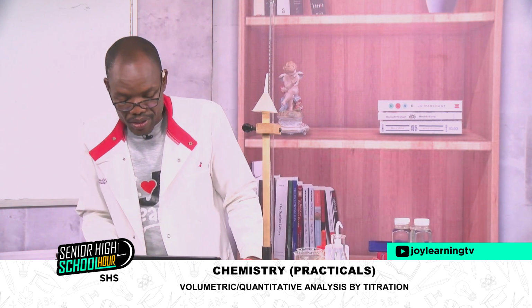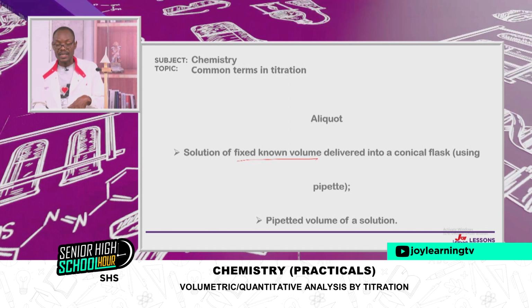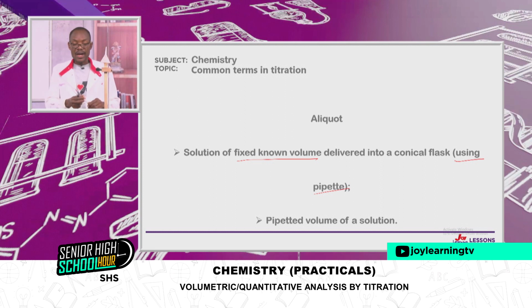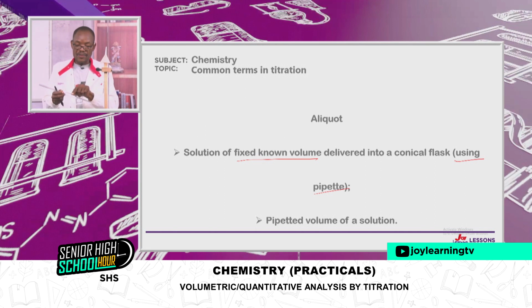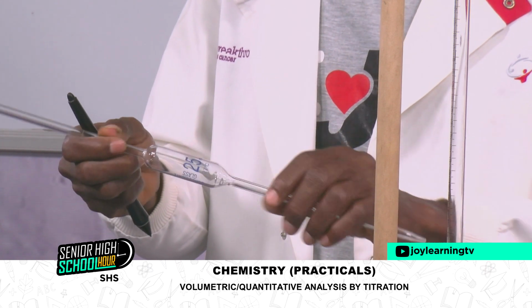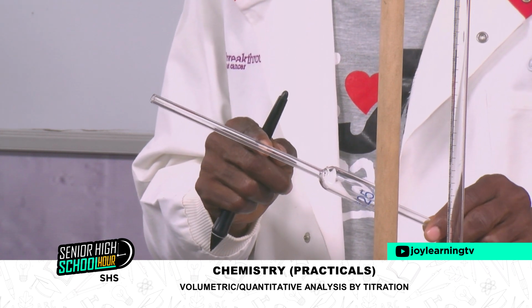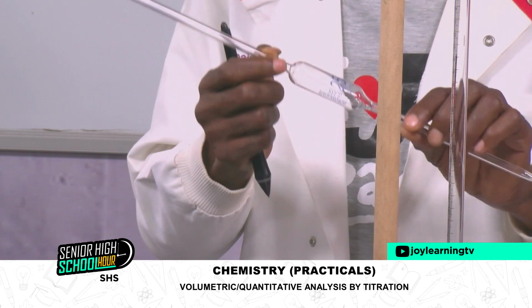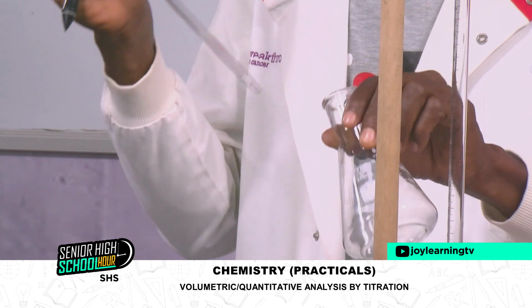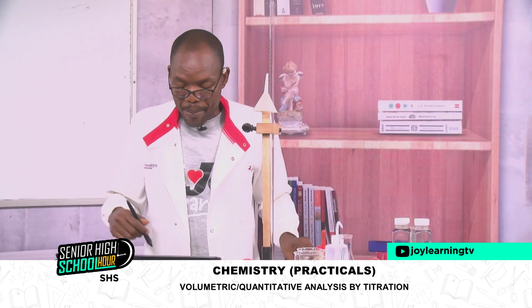The next one is aliquot, a solution of fixed known volume delivered into a conical flask, and of course we use the pipette. The pipette gives us a specific volume. The one I have here can deliver 25 cm cubed of volume, so it gives us a specific volume, and the mark is there. So if you take it to that mark, then it is 25, a specific volume, and this you deliver the solution into a conical flask. So that is the aliquot or pipetted volume.